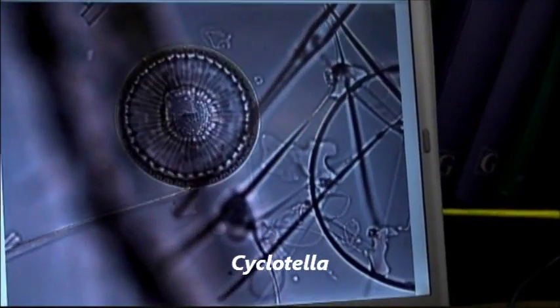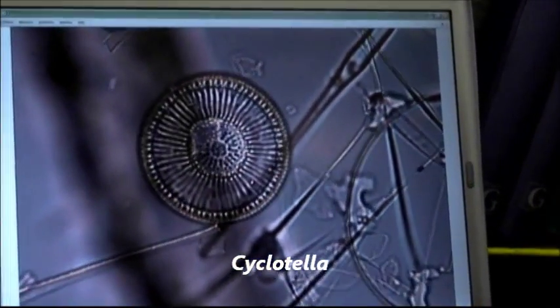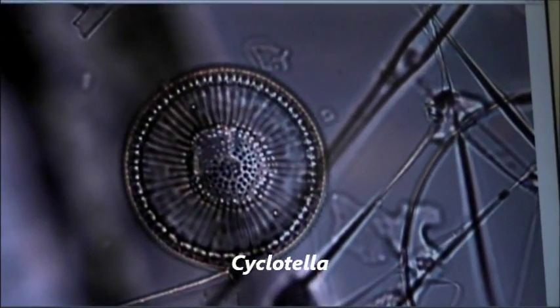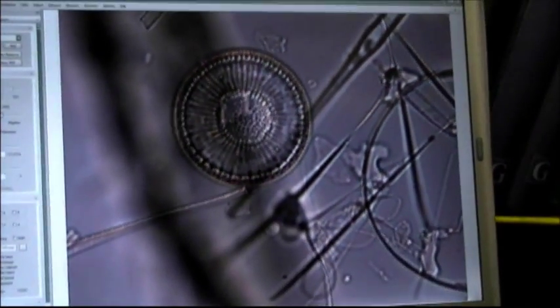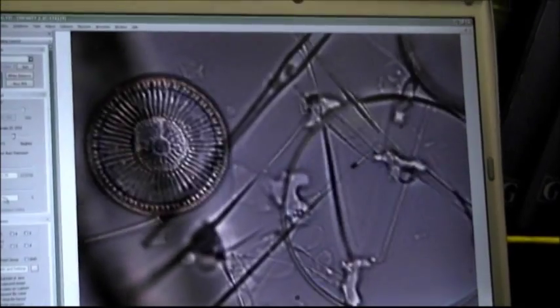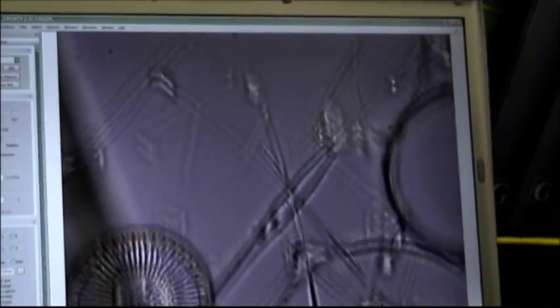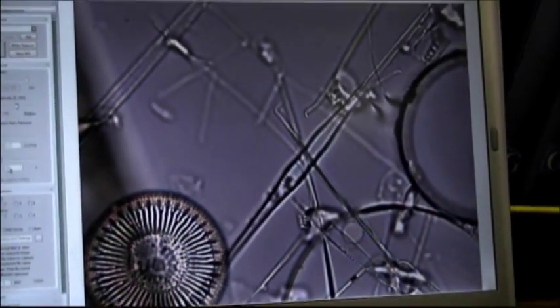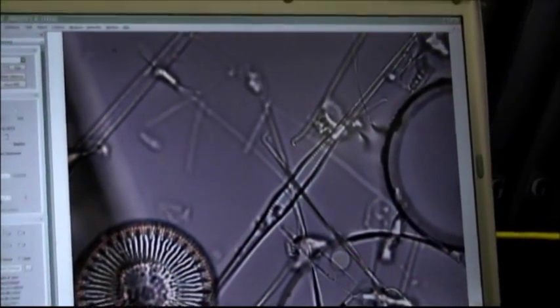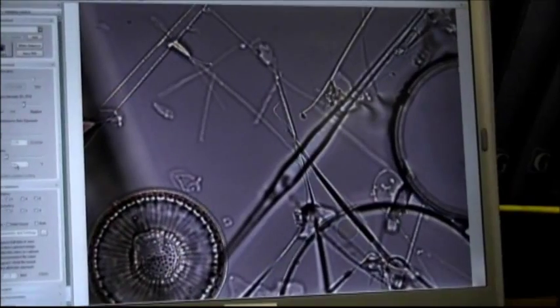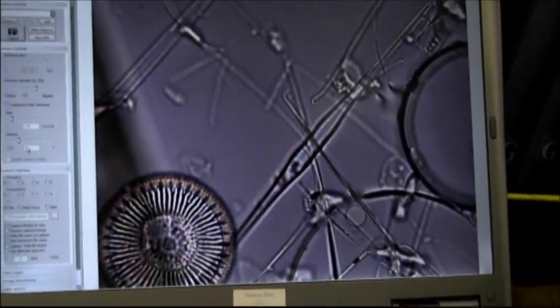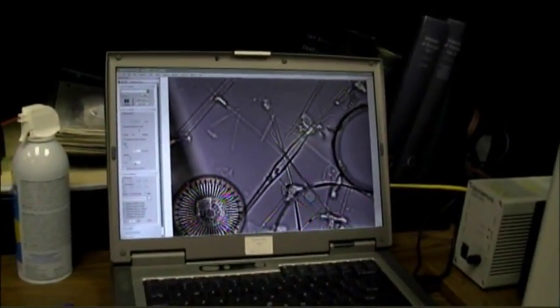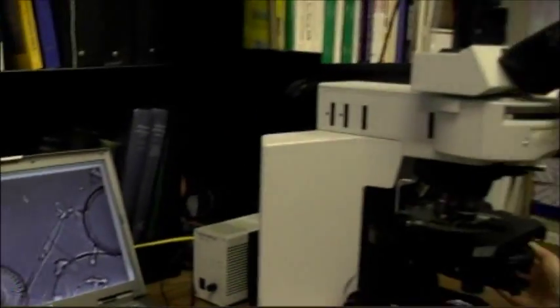Here's another one called Cyclotella. And everything you see in here, for the most part, are the remains of diatoms. And so we scan transects along these slides and count what we find. And based on the abundances of the different species, we can get environmental information. It's rather statistically intense, but that is the short of the story as we actually look at the numbers that we find.